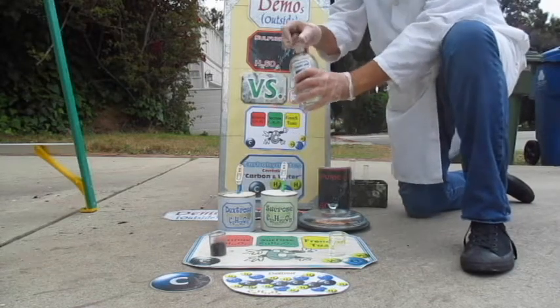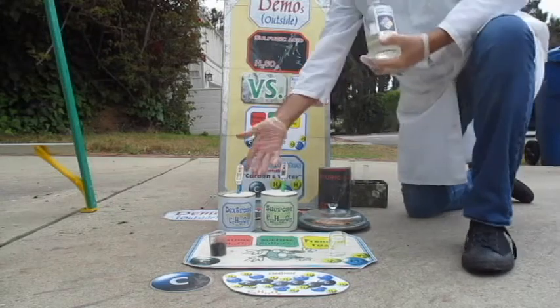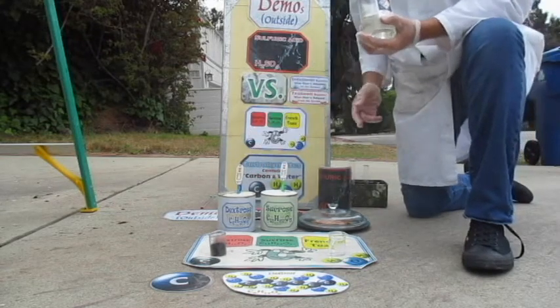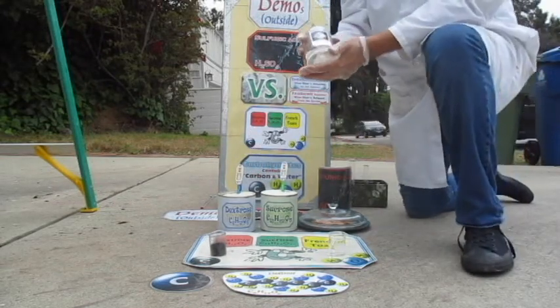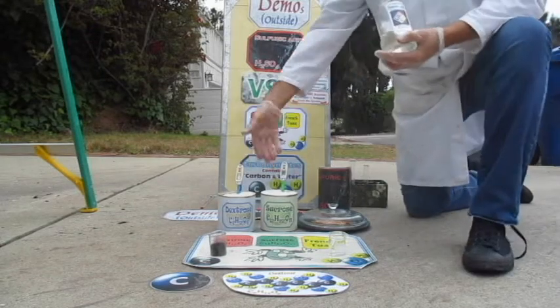Okay, but what I'm gonna do is use this as a catalyst, because if you put sulfuric acid into carbohydrates, well, what's H2SO4? It's for dehydrating carbohydrates.